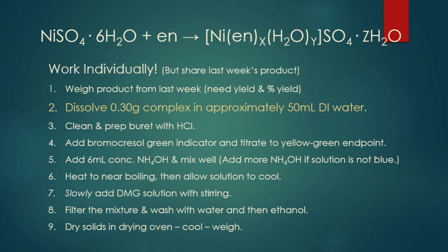So you do want to weigh it and then write down the exact mass that you have. This PowerPoint, by the way, I put a copy in both my folder and Mr. Leonard's folder, so you'll have access to this. You can just download it and look through it. I see people taking pictures. If you want to, that's fine, but you can get this as well.